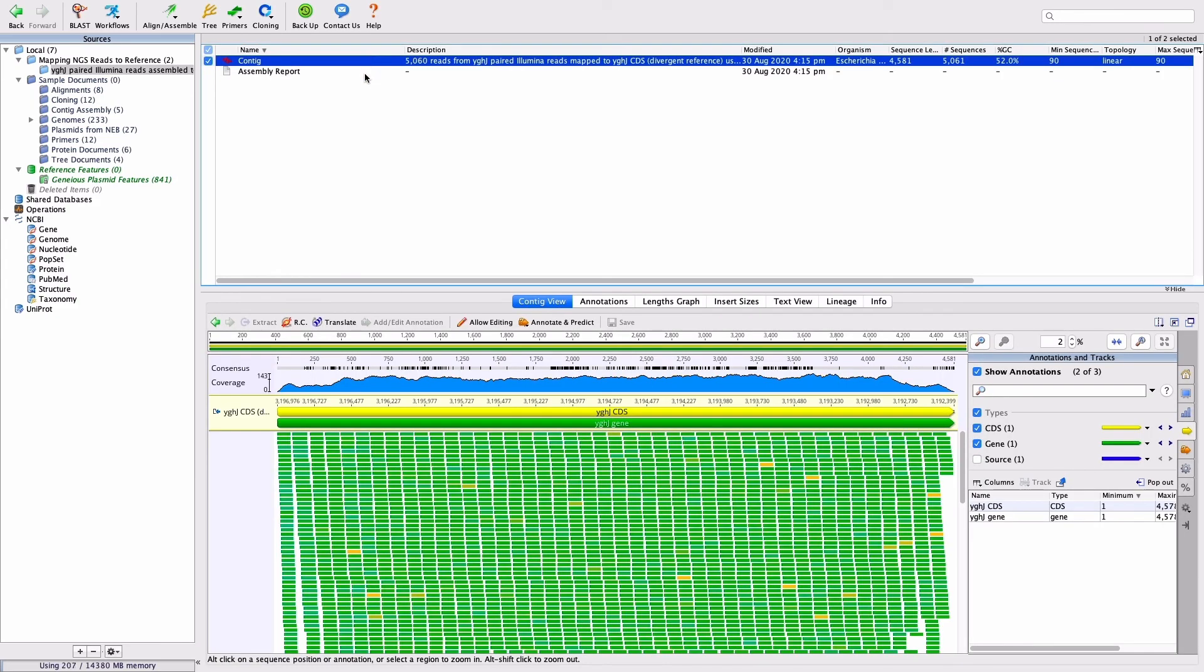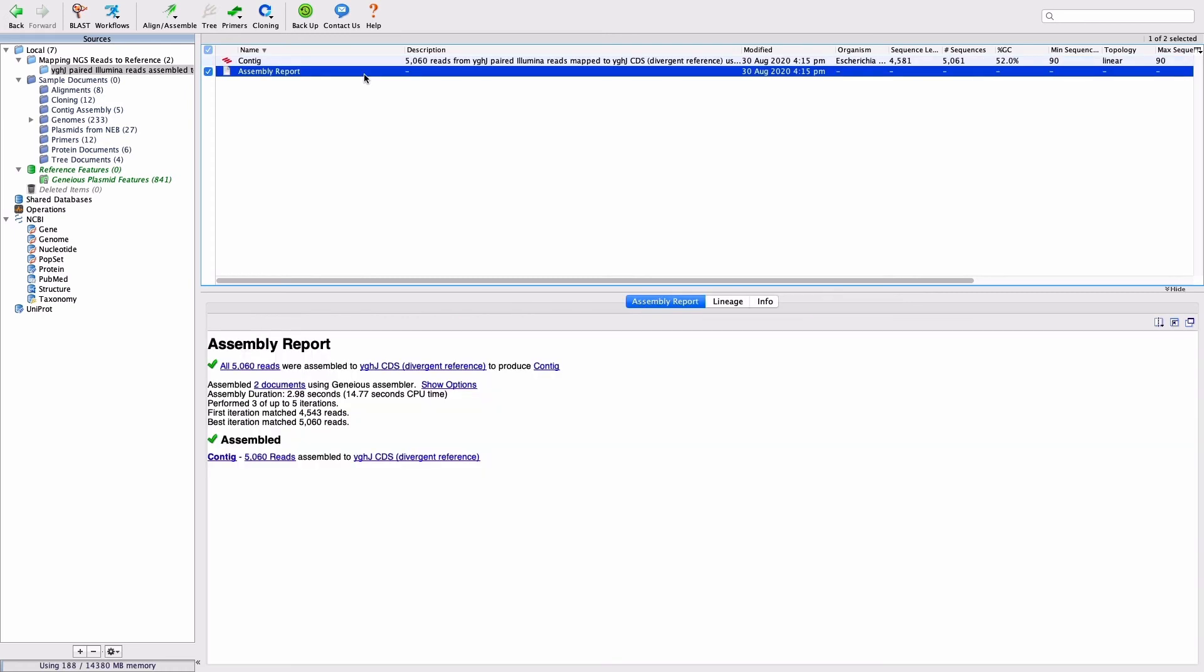Open the assembly report, and you will see how many reads were assembled, how long it took, and what contigs were produced.